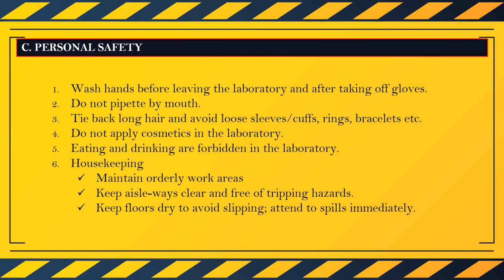So next are very basic factors that everyone must be aware of. So listed here in this particular slide are quite objective and easy to apprehend. So number one, under personal safety, wash hands before leaving the laboratory and after taking off gloves. And of course, do not pipette by mouth, tie back long hair, and avoid loose sleeves or cuffs, rings, bracelets, and etc. Do not apply cosmetics in the laboratory.